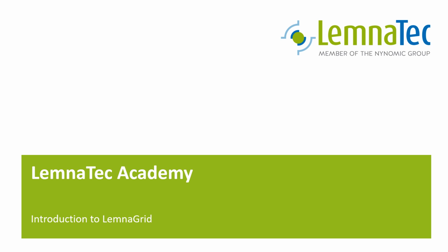With this video, we have our first look at LemnaGrid. These videos are based on LemnaGrid 24.6, unless stated otherwise.